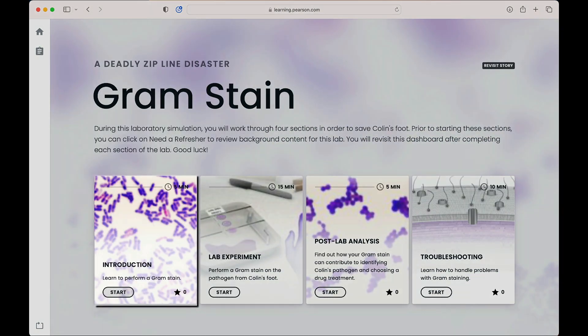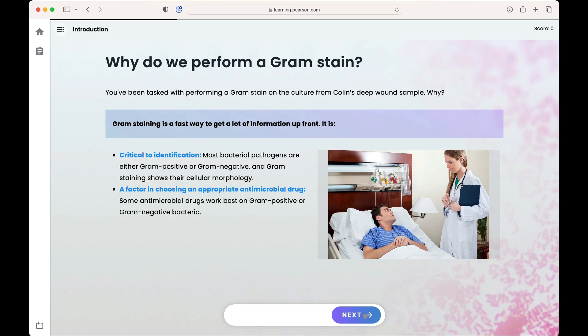Students will start with the introduction, whose purpose is to prepare them for the lab experiment. In the gram stain, the introduction provides students with an understanding of the difference between gram positive and gram negative cell walls, details of gram stain steps, and visualizations of cells and cell walls at each step. In this first screen, students will revisit lecture and background material to set them up for success in the lab.